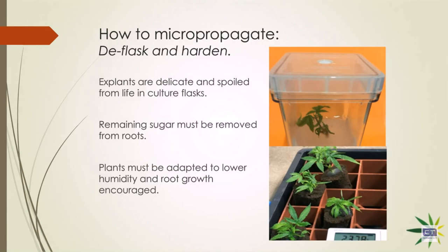Your transplanting process might be a little different because you're working with material that's a bit smaller. A little bit shorter. Yeah, so you have to take better, different care of it once you're getting it to soil. But once you're at this point, with that root growth, dealing with the plant, you would never know this was done from micropropagation if no one ever showed you what happened in the back end. You would just think, oh wow, that's a small clone. Yeah, it's got a lot of foliage, looks great, healthy.